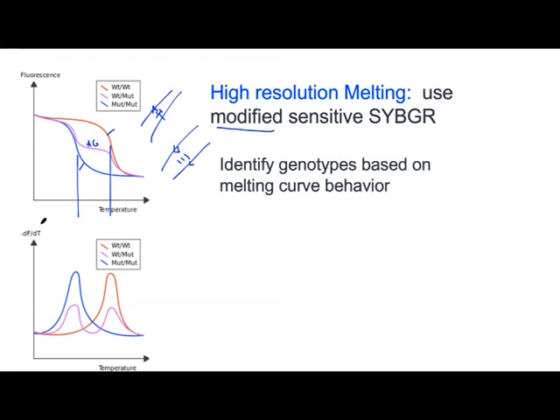And actually you can do the derivatives. This is some of the derivatives, in Arabic it's called الاشتقاق. If you guys remember your math in the past, it can change this graph to look like this. So what you do here, you take a 96 well plate. All what you need to do, just put 2 primers. And there are actually some rules on high resolution primers.